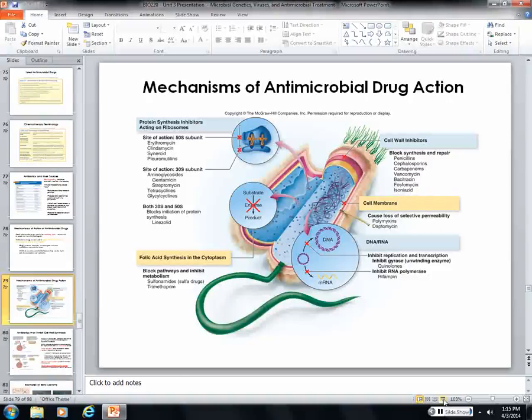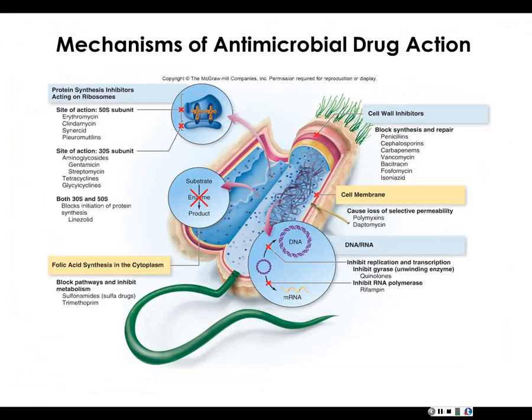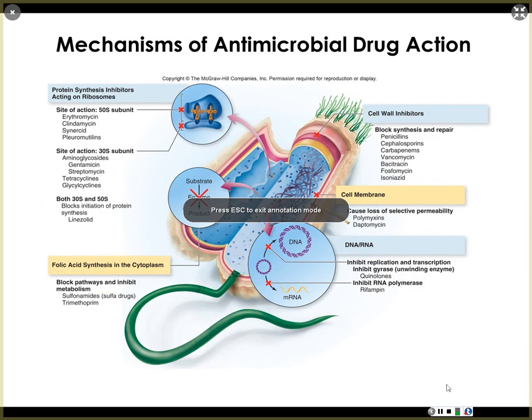The antibiotic testing you guys set up on Tuesday. Unfortunately, you guys tested a gram-positive organism and a gram-negative, and neither of the gram-negatives grew out very well. They were brand new cultures I'd just gotten from a company, and I think they were old cultures, and they didn't have time to grow out enough before we used them. So we're going to focus in on your gram-positive plate for our follow-up this afternoon.